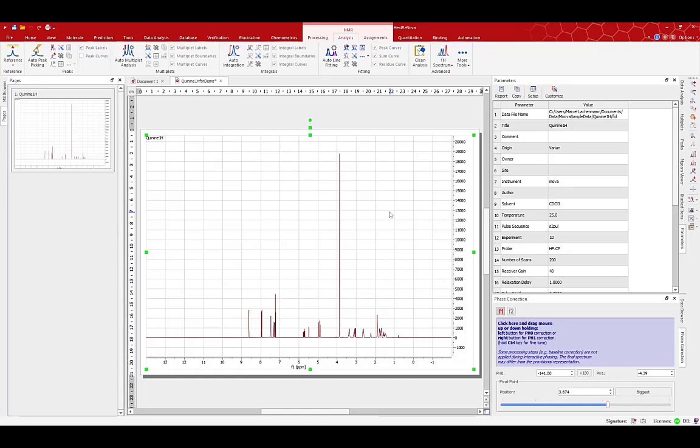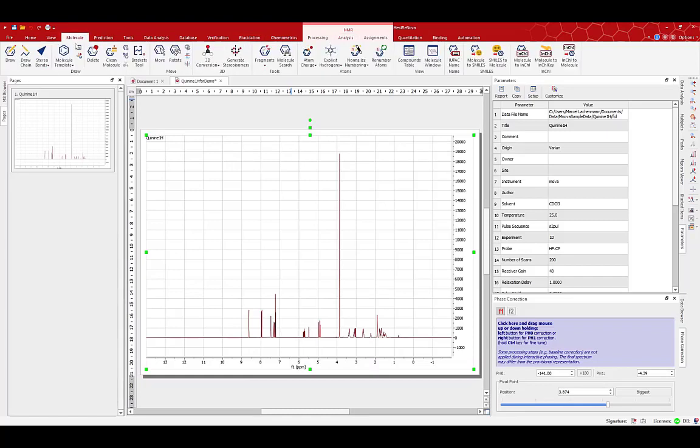You probably already know that Mnova has a powerful intuitive interface, so it's easy to access functions with a minimum of clicks. But sometimes, just moving your mouse up to the ribbon for 1 or 2 clicks can seem like a lot. So, Mnova provides keyboard shortcuts to make spectral manipulation even easier.